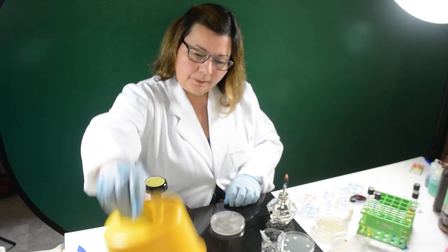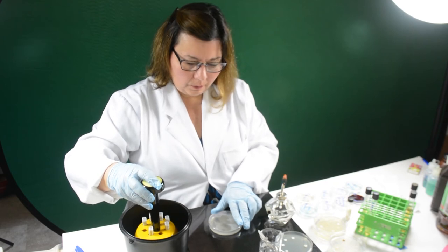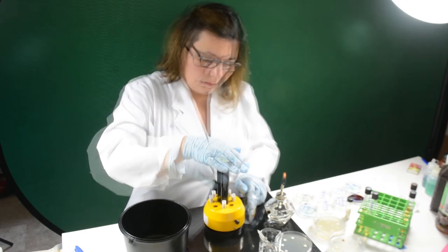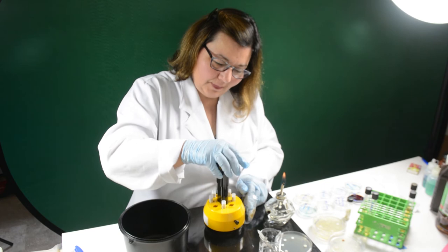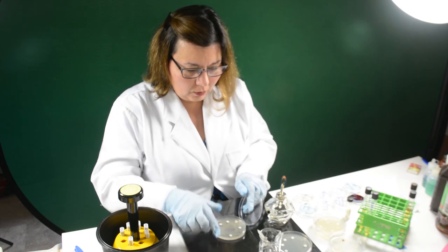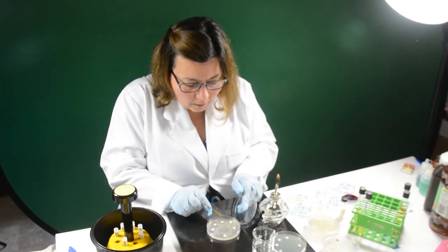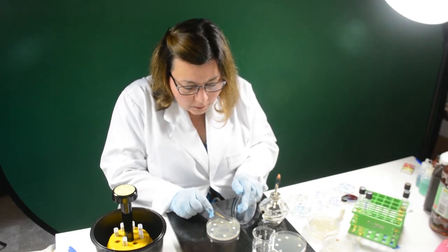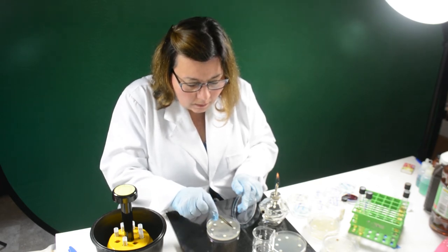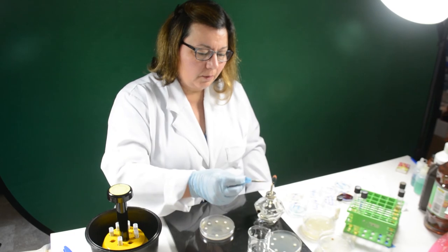Working with one plate at a time, place the inoculated plate on a flat surface. Lift the lid of the plate and hold it with your hand. Take the dispenser and place it over the inoculated plate, then press the plunger down once to dispense antimicrobial discs onto the agar surface. Touch each disc with sterilized tweezers to ensure complete contact with the agar. If they didn't lay flat, push the disc gently — do not relocate any of the discs, since the antimicrobial agent begins to diffuse as soon as it contacts the agar.